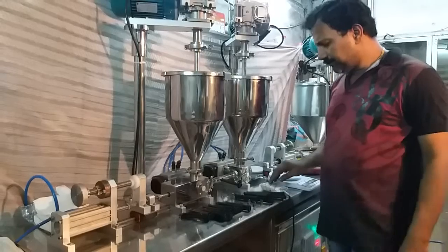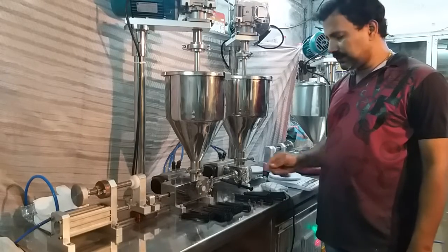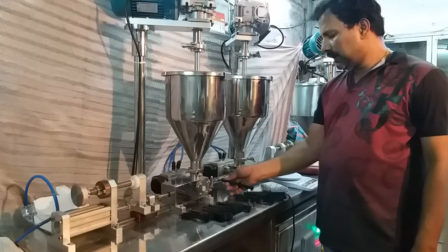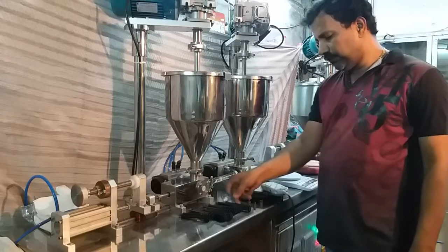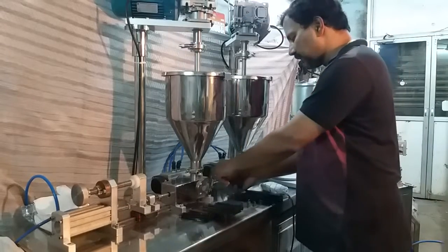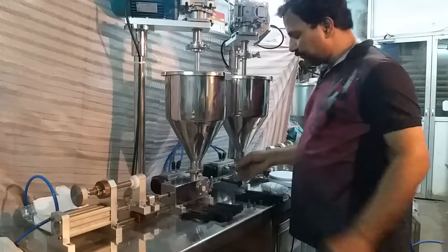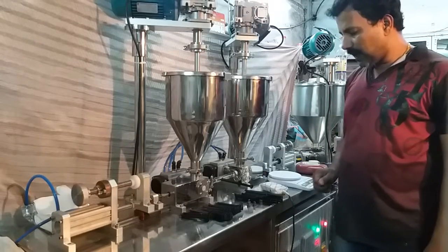This machine is used for filling dual cartridges and single syringes with luer lock or taper nozzles. It is very useful for dental and pharma applications. Also, this machine is used in chemical industries to fill epoxy paste, resin, hardener, and similar materials.